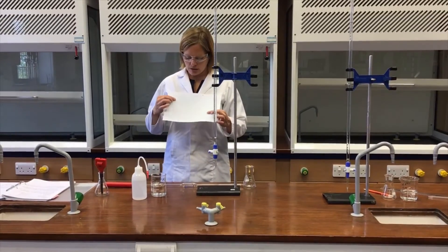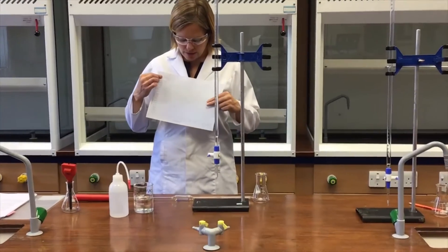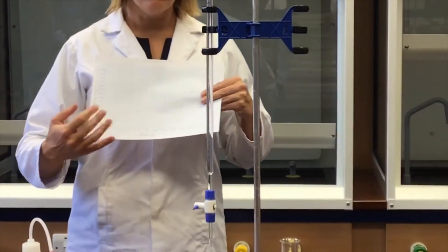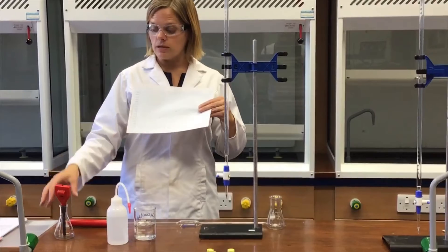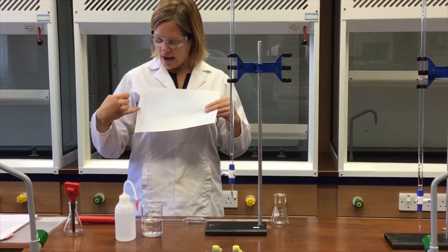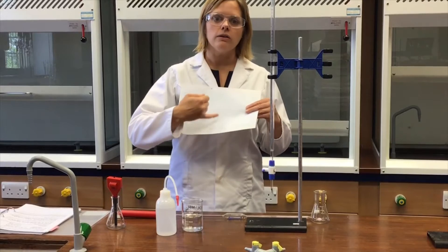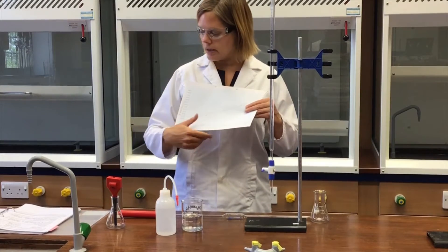The calibration curve looks like this — it's come out as a nice straight line of best fit, which is quite handy. What I would need to do for the practical is make the meter readings using the same pH meter and then use this calibration curve to convert those values into true pH values.